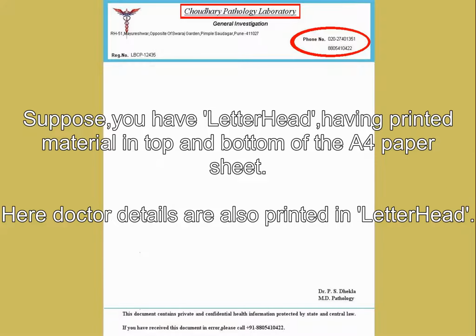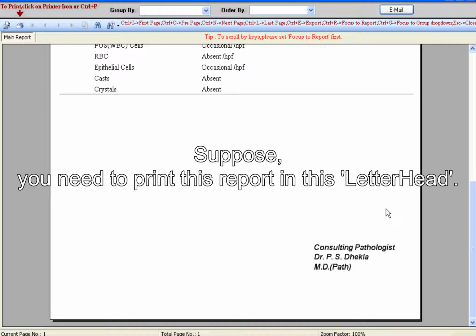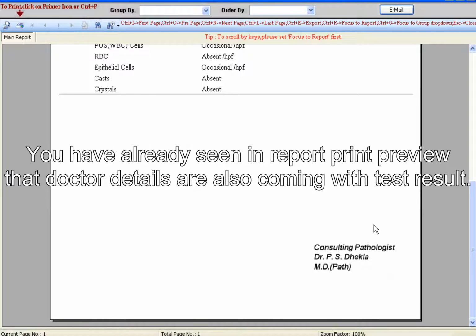Suppose you have letterhead having printed material in top and bottom of the A4 paper sheet. Here doctor details are also printed in letterhead. Suppose you need to print this report in this letterhead. You have already seen in report print preview that doctor details are also coming with test result.